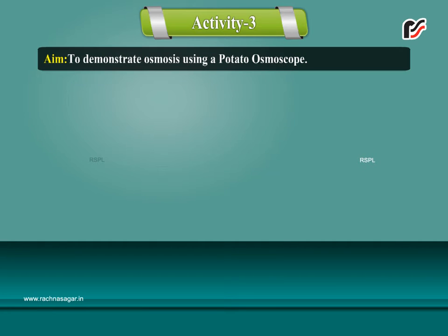Activity 3. Aim: To demonstrate osmosis using a potato osmoscope.